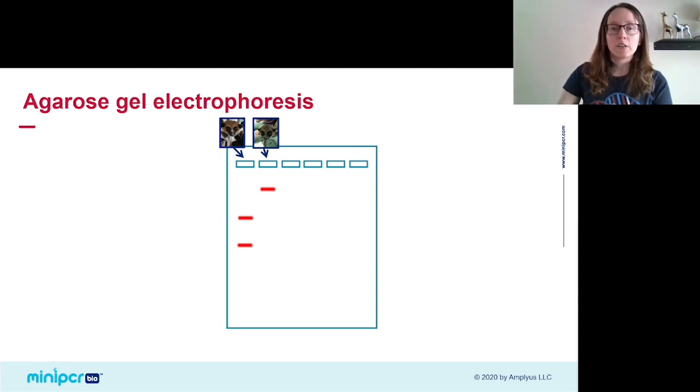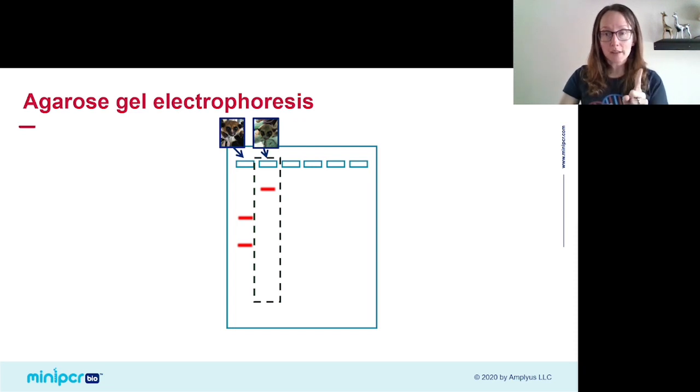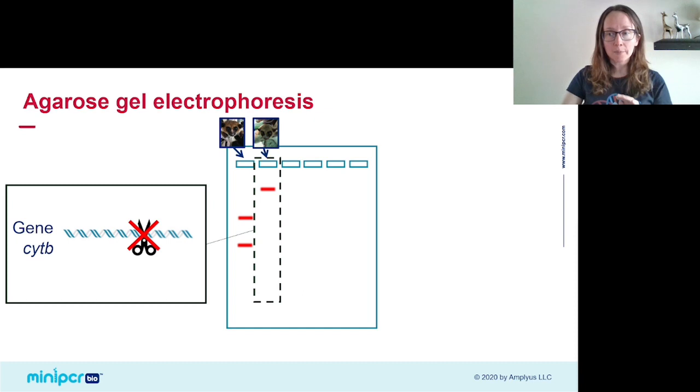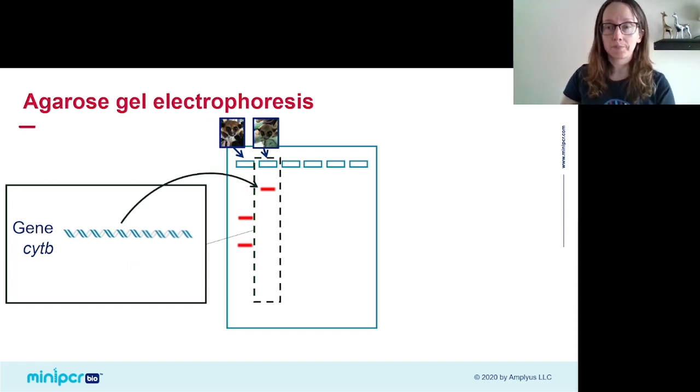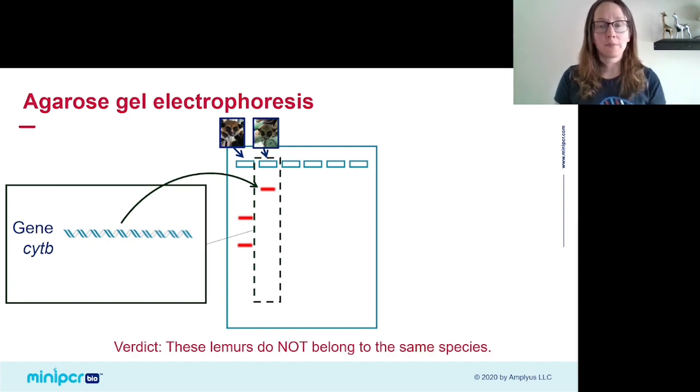Now let's look at our mystery lemur. In this lemur's DNA sample, we see just one band, meaning the DNA fragments in this sample are all of the same size, and that size is larger than either of the fragments we saw in the first lemur sample. This means that the restriction enzyme we used did not cut this lemur's Cyt B gene. Remember, that enzyme only cuts the Cyt B sequence in lemurs from the species C. crossleyi. Because it didn't cut, we can assume our mystery lemur is not from C. crossleyi.